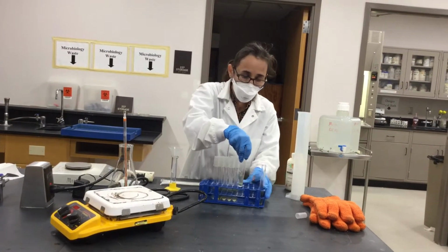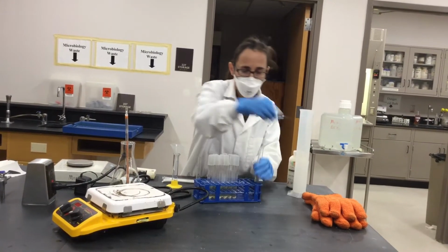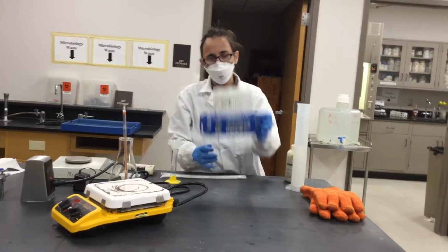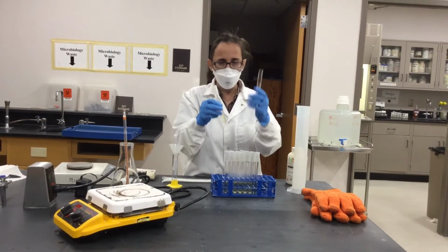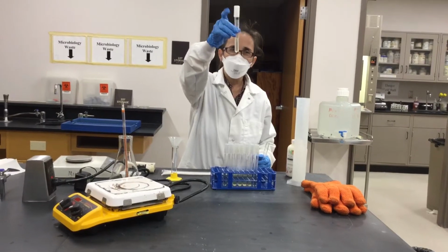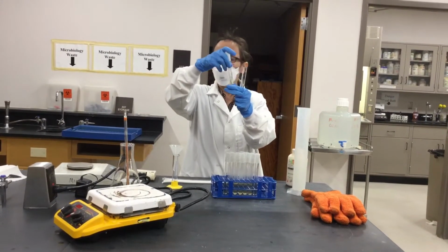So anyway, out of that 100 milliliters, because I added less volume, I end up with around 13 test tubes. And if you see, well, I'm not going to sterilize this water, but if you see how this media already solidified at room temperature and how it stayed like that, we don't want it like that.